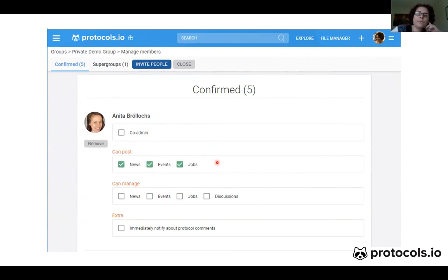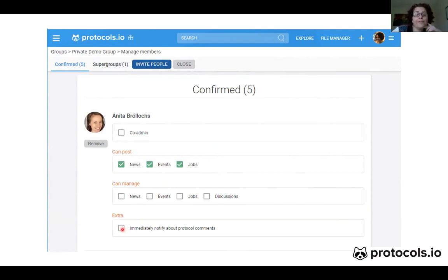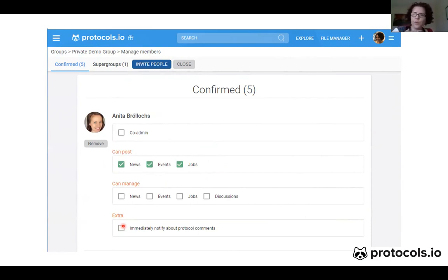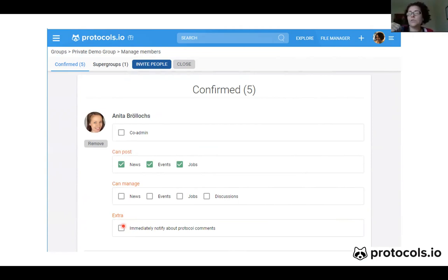You can also manage what members can post — whether they can post news, events, or jobs. You can also check a box so that a person will be immediately notified about protocol comments. Normally, all members of the group will receive a digest every two weeks with everything that happened within the group, but if you check this box for one member, as soon as there is a comment on a protocol, that person will immediately receive an email.